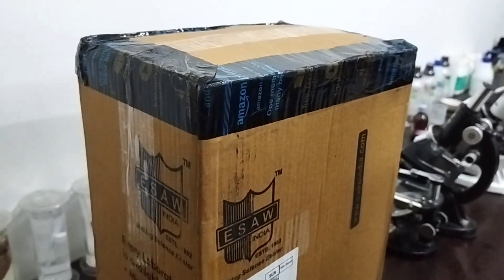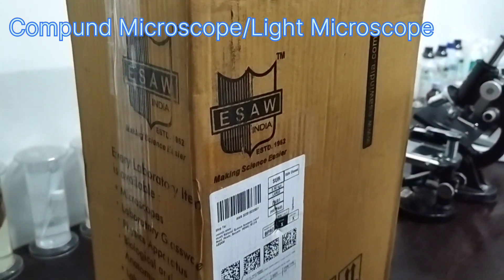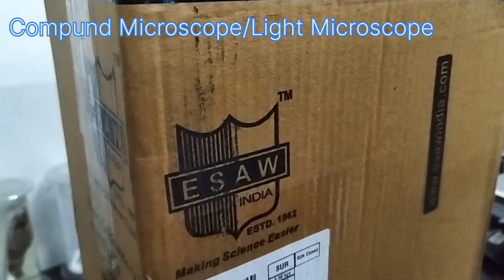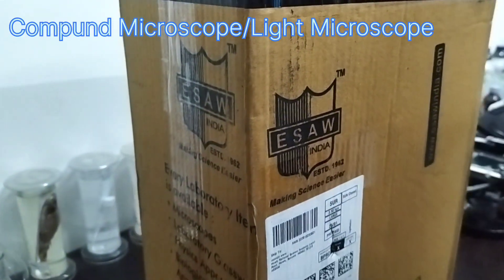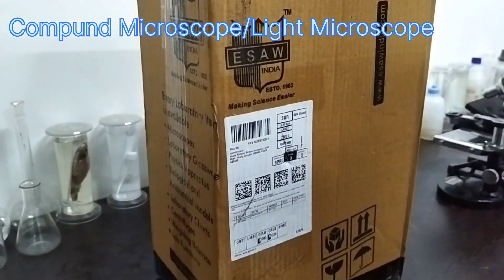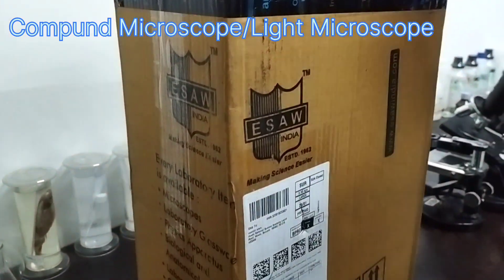Okay everyone, so today we bought a microscope from Amazon. The brand name is ESAW India, it is about 4000 rupees. Let's unbox it — it is a compound microscope.